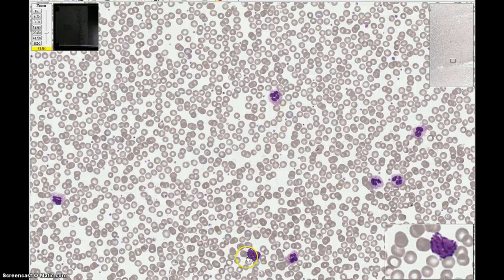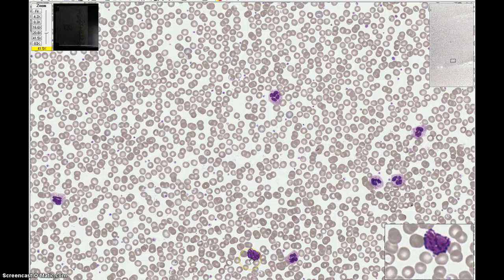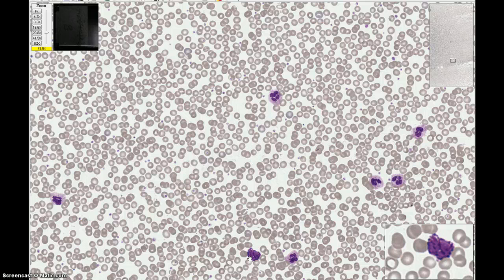Let's look at this cell down here. It's kind of hard to see the nucleus, but it looks like there are two segments or lobes, and there is some dark purple chromatin. The granules are the distinguishing features of this cell — they are quite large and stain a very dark purple to black color. So this cell is a basophil.